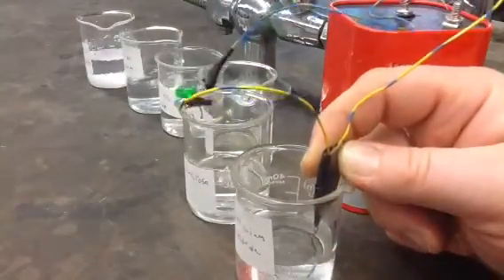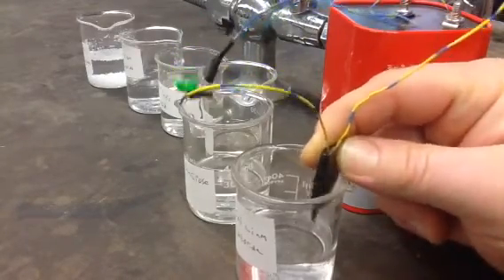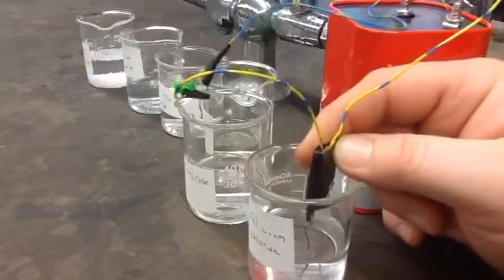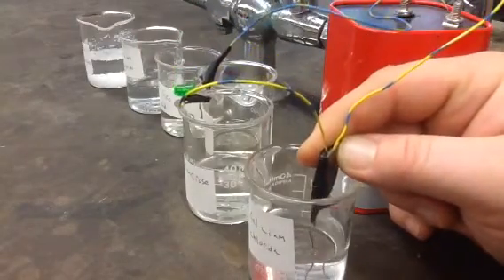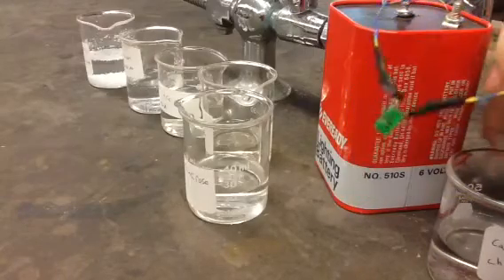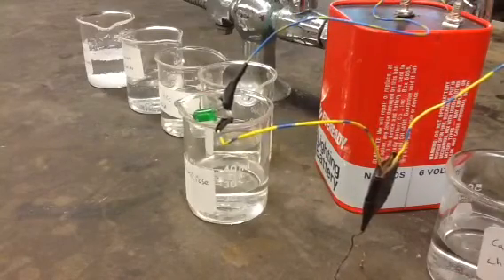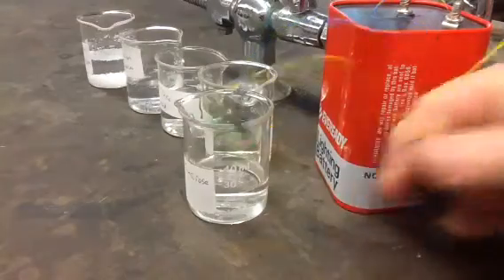Try to get that on camera. Dark. Oh, come on. Is it lighting? Yeah. Okay. Nicely lit. So we would say that calcium chloride is a conductive solution. Oh yeah, I see it now. Okay, so we'll give our electrodes a quick dry off. So we'll set calcium chloride aside.